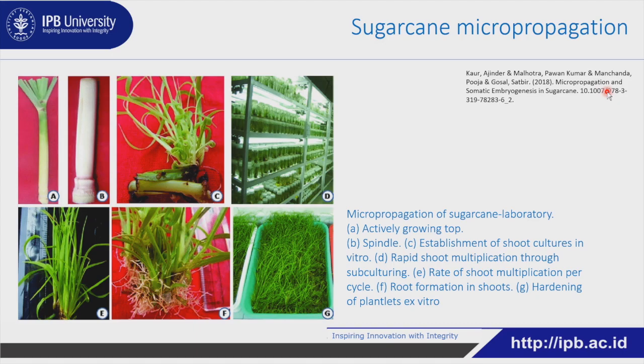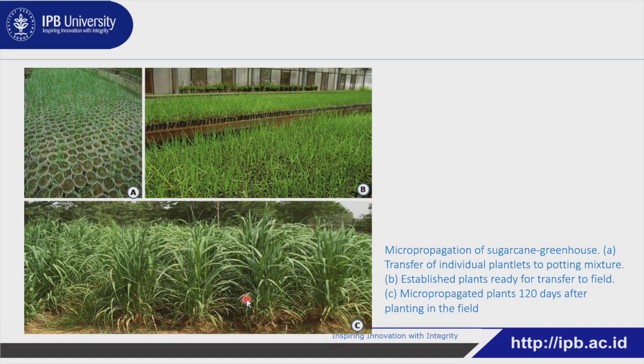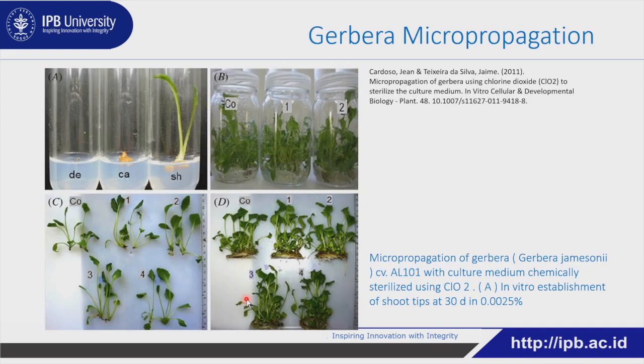The pictures are basically the same, but this is maybe easier compared to oil palm. After that, they do acclimatization and transfer it into the field.